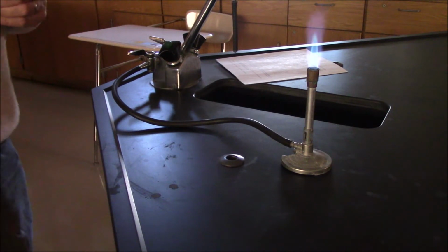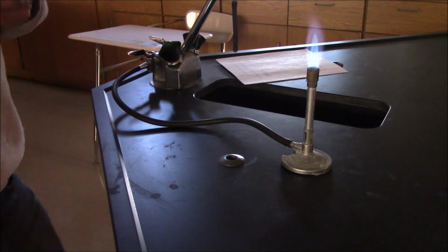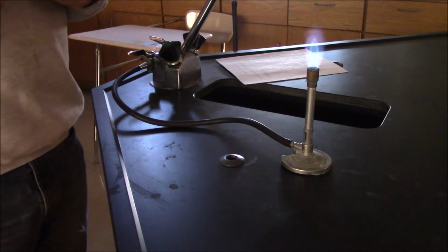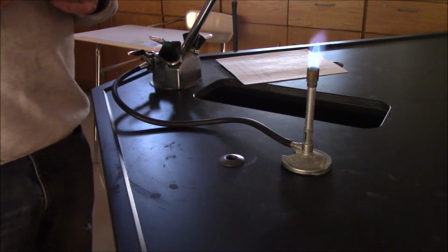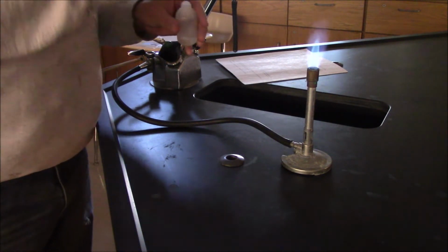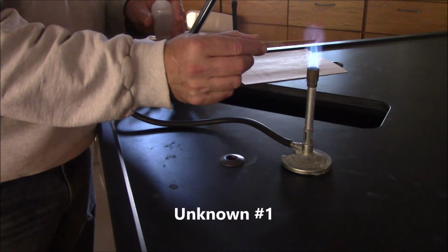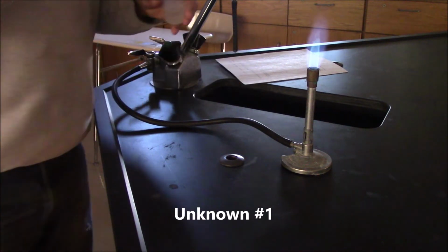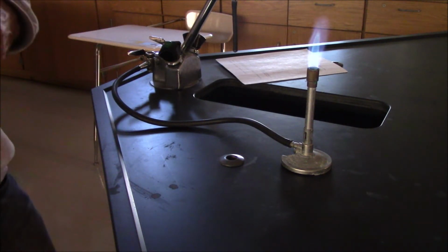And then you have an unknown, and your job will be to give your best answer as to what you think the unknown is. If you can tell with some certainty, say so. If you can only narrow it down, that's okay too. So here's your unknown. And that completes the flame test portion.